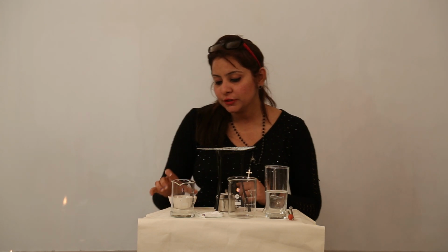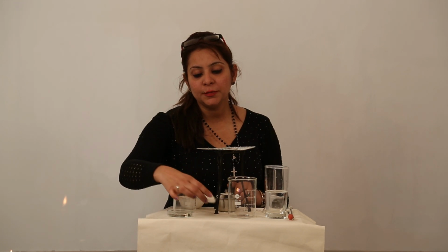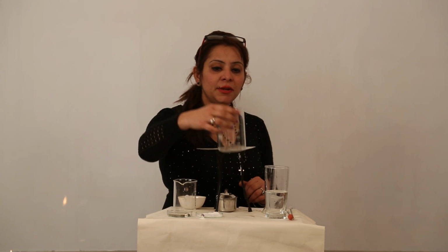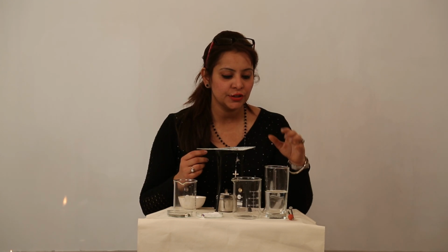And the apparatus which is required, I am just making you familiar with all those things. See, this is a china dish, this is a small beaker, this is a petri dish containing the sand, this is again a petri dish containing salt, because these two will be mixed to make a mixture. This is again a beaker, but a big size beaker. This is the water, clean tap water which I have taken.